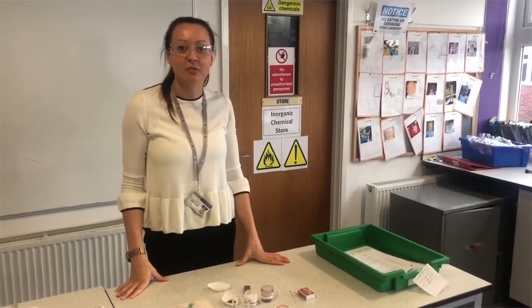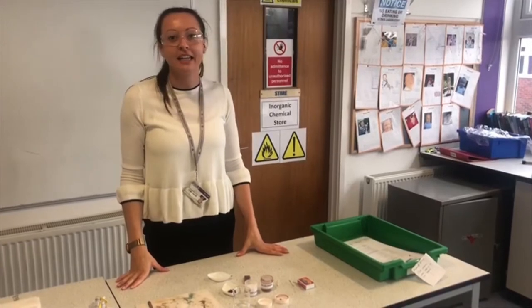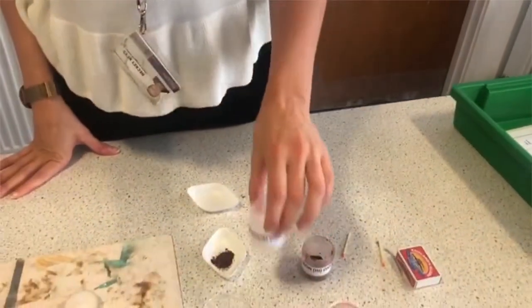Today we're going to be looking at the science behind superheroes. I'm going to be looking at how Iron Man gets the iron for his suit. So we've got a couple of chemicals here — we've got iron oxide and we've got sodium carbonate.